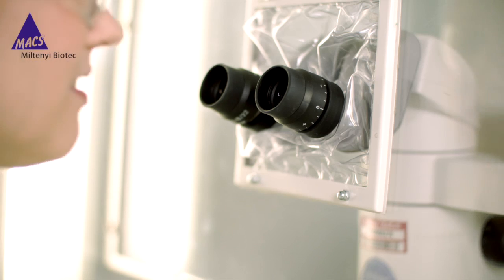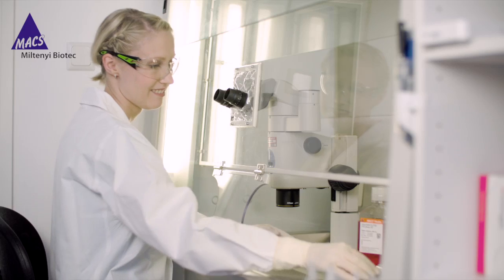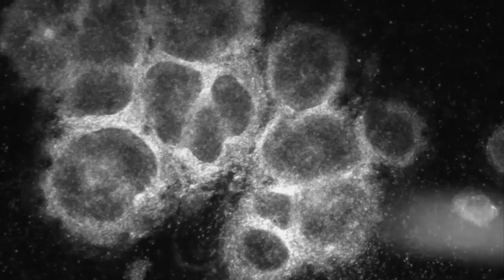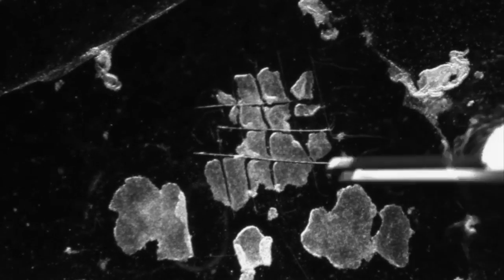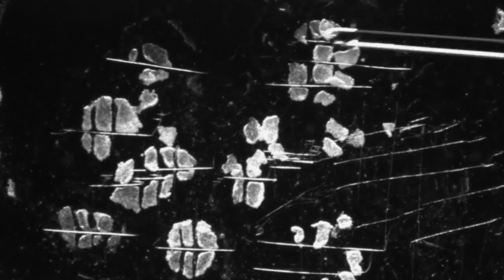The latter can be accomplished by three general methods. First, the colonies are cut and the resulting cell clusters are transferred into new cell culture plates. This is the original passaging method for ES cell culture. However, nowadays it is less frequently used because it is more laborious, time-consuming, and not useful for large-scale expansion.